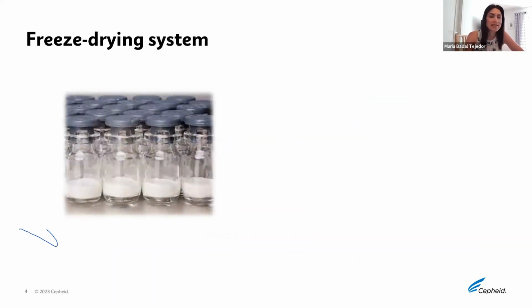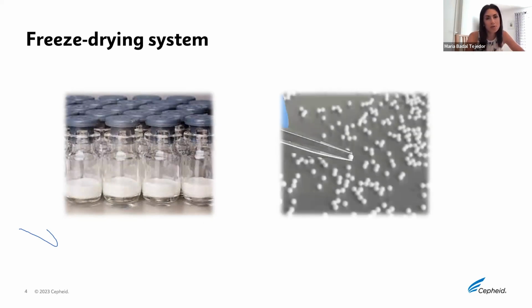The most common setup is to lyophilize in the form of vials. But what we're going to do right now is to lyophilize in the form of beads. So that means that the process is going to change. The freezing step is going to be different.